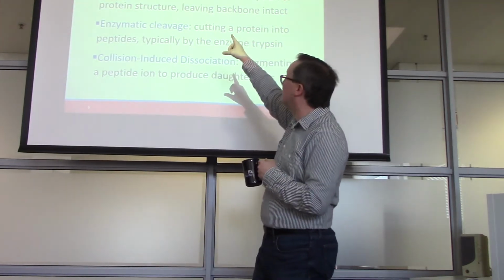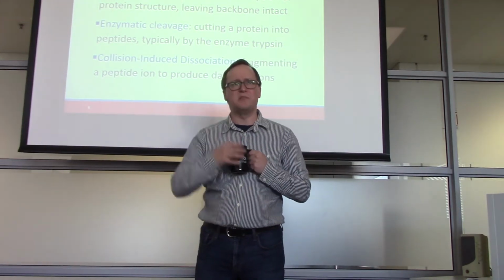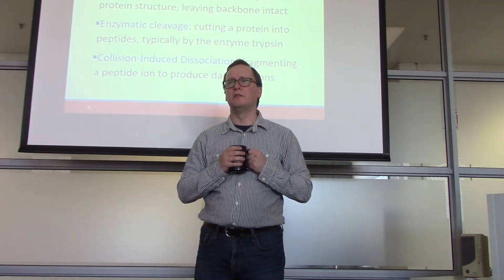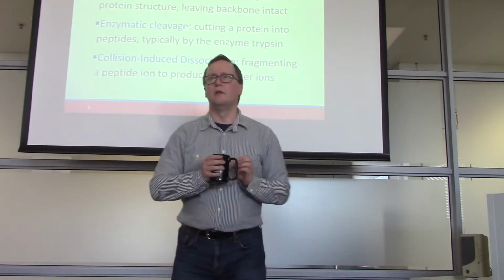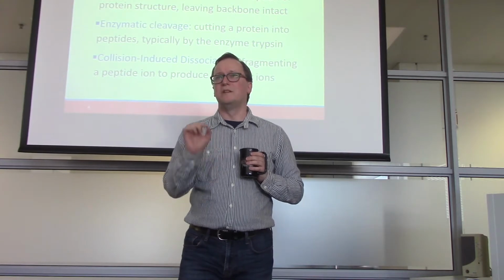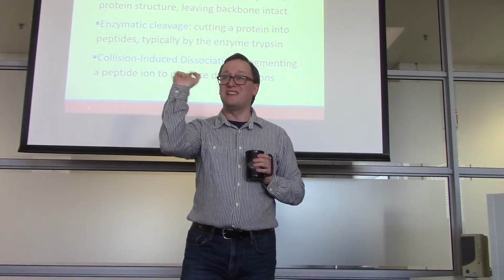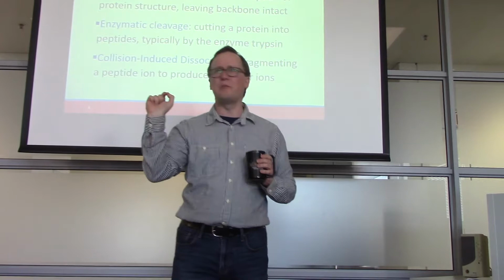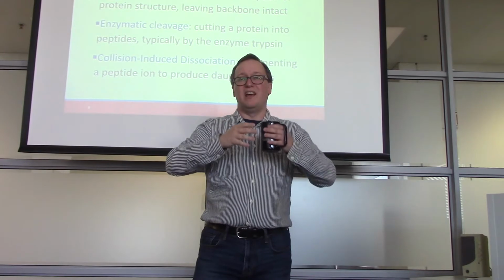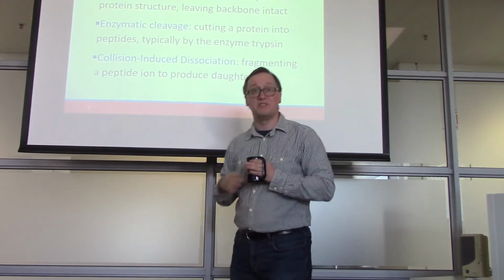Okay? Now, the other piece of it is reduction. What is the reduction step targeting in helping us break up these protein structures? Reduction. Okay. I tend to nickname these the safety pins of the protein structure. Part of the structure of a protein is quite frequently the creation of disulfide bonds between cysteines. Does everyone remember that from protein structure class? Right, so disulfide bonds forming between cysteines hold this structure in place. So you need to break those bonds somehow. We do so by reducing them.